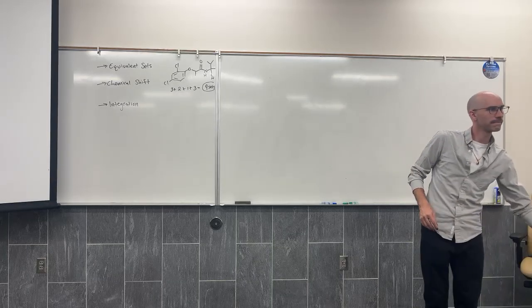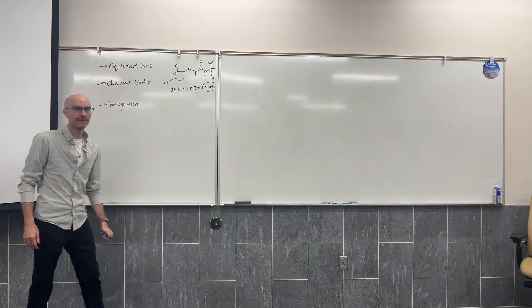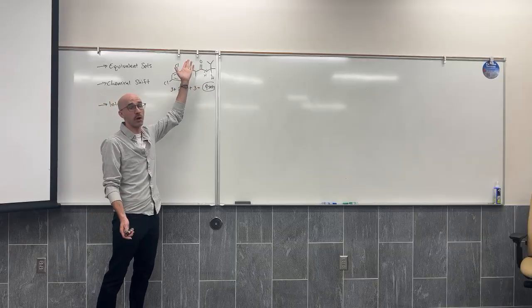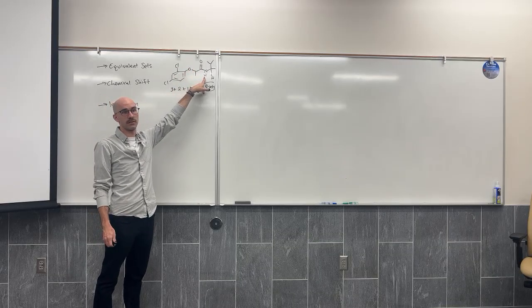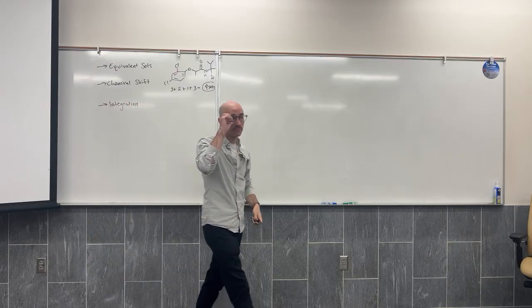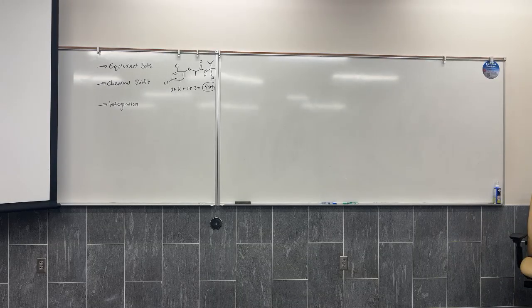What do you think? The ones bonded to carbon would be the furthest to the right. Okay, here's bonded to a carbon, carbon. So that's most of them except for this. Is that what you're thinking? I imagine most of them would lean towards the right then, depending on what those carbons are bonded to, could adjust it. Because yesterday we said bonded to less electronegative groups, more to the right.